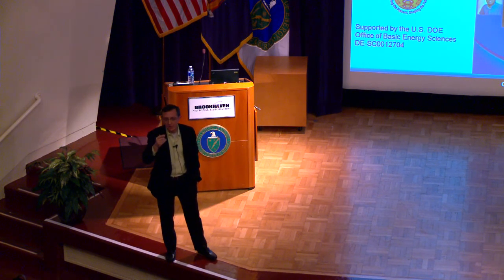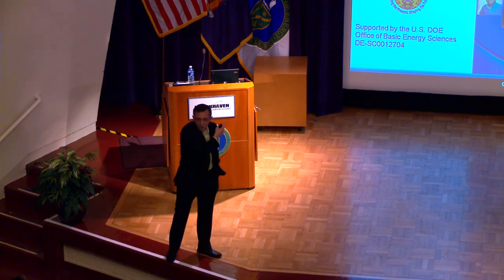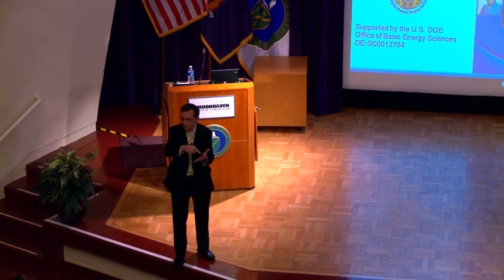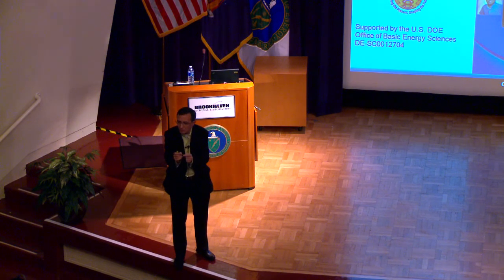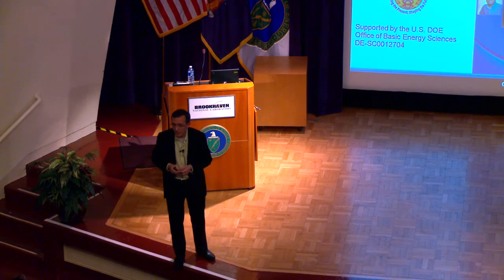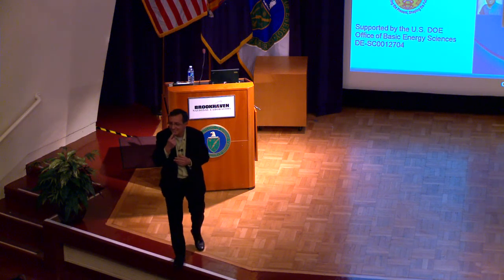And when you say, I'm trying to understand the question, when you say the relevant scale, size or energy? Length scale. What do you think the relevant length scale would be in order for you to have useful information about the catalytic process? So the XPS and infrared are macroscopic measurements. It's not microscopic. It's macro for all intents and purposes. The only one where we could actually resolve sub-nanometers is scanning tunneling microscopy. So if I have a millimeter spot size, that would be relevant for our measurements. Okay.